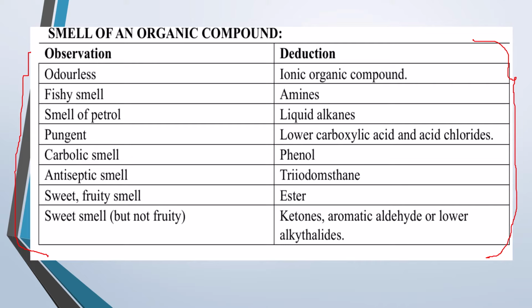So mainly amines are going to have a fishy smell. I hope every one of you has heard how fresh fish smells. So amines have that fishy-like smell. And what you need to note here are the amines together with the esters.